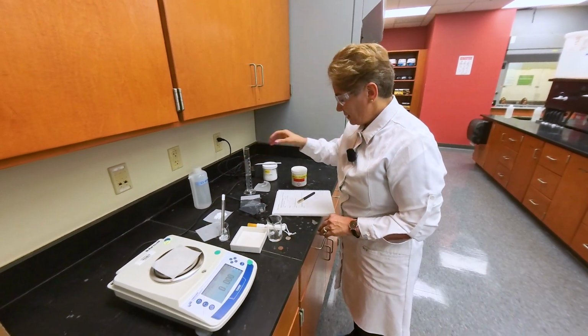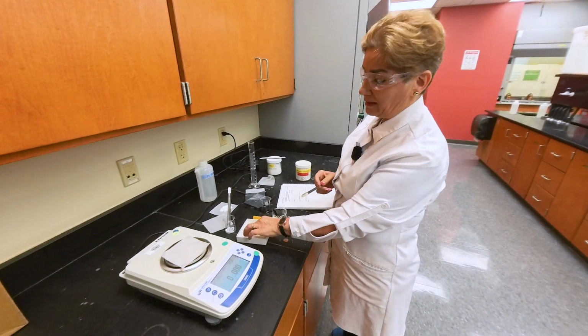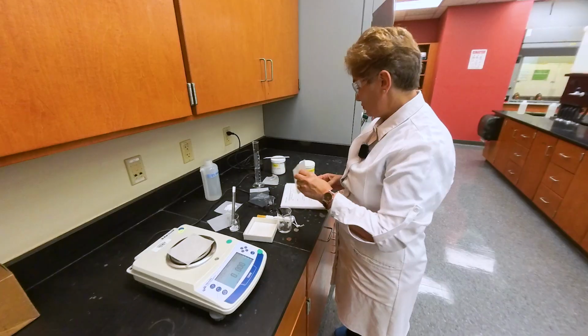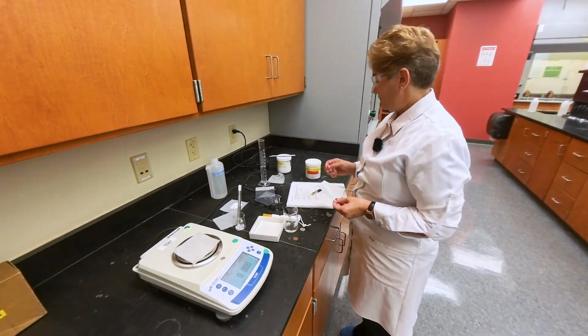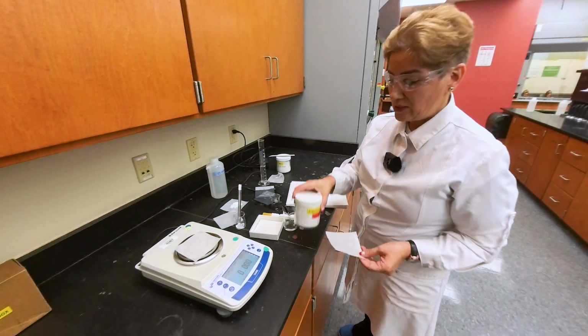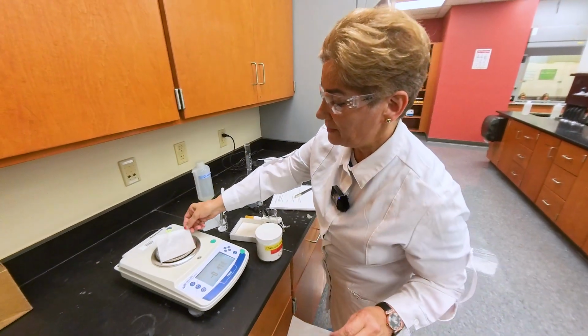Next, it's mass of the first, second, and third spoon or spatula of the sodium chloride. So what we do in this case, we are going to use a weighing paper.